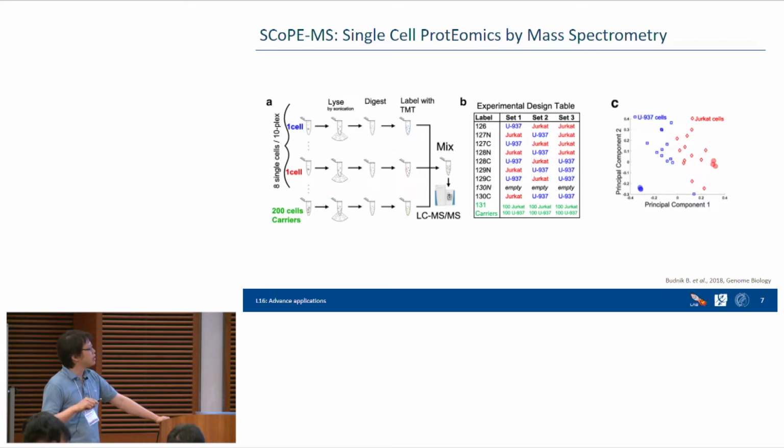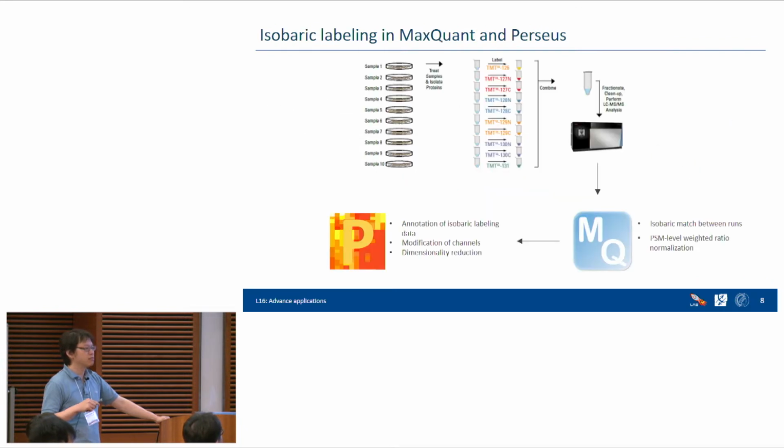In their analysis, they found that the total identified proteins in TMT is more than label-free quantification, but label-free can identify more peptides. The interesting thing is the unique peptide count is actually higher in TMT. This means perhaps in label-free quantification, some low abundance proteins cannot be captured.